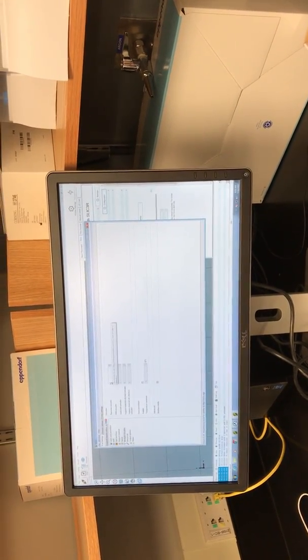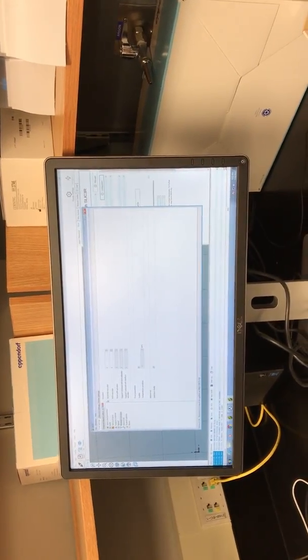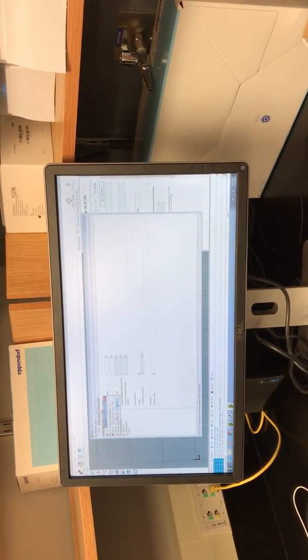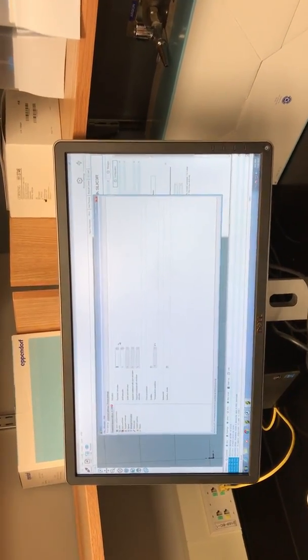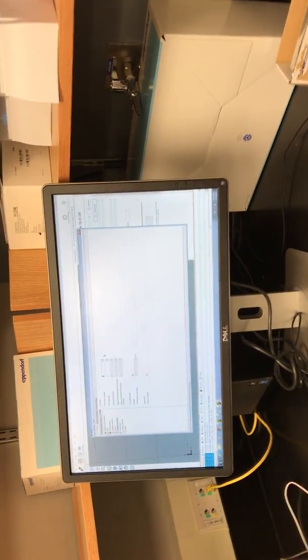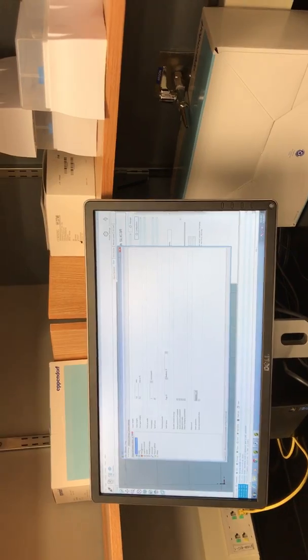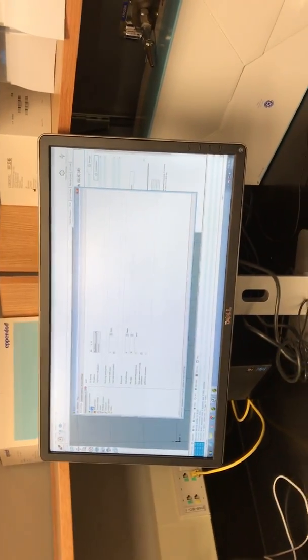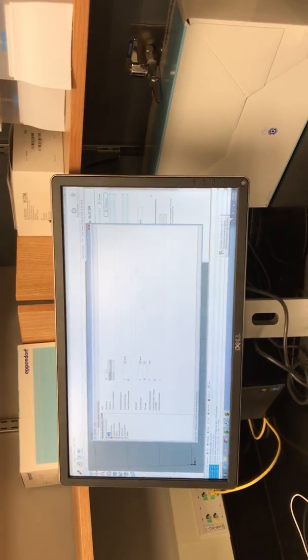It's just that when you make changes, they will not do what they're supposed to do unless you save it as a new file. Of course you can make changes, but then you need to keep track of them. You can always go back here to all of these settings to understand how each print setting is configured.